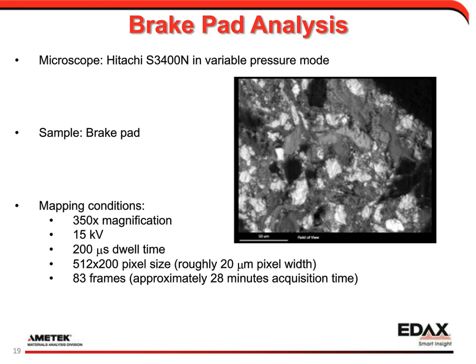There is another question about the carbon coating I mentioned applying to my sample: whether we can apply other coating material corrections. Right now, the answer is no. It's something we have been discussing a little bit.